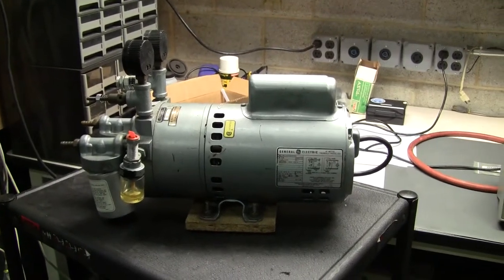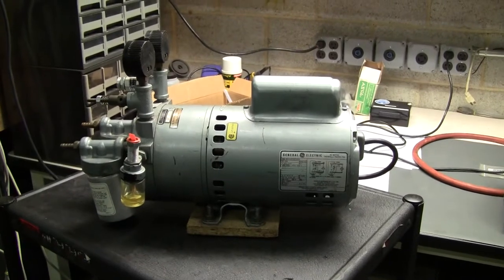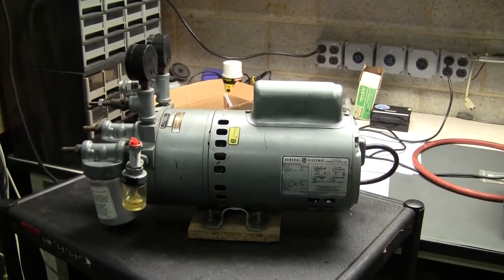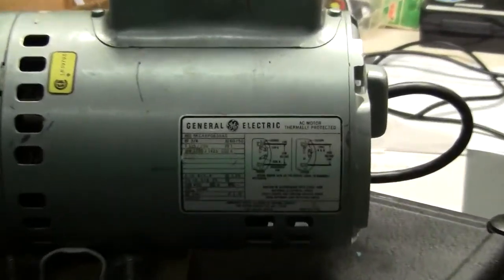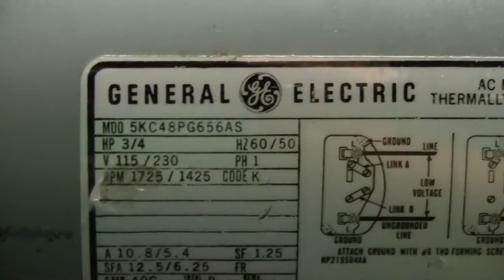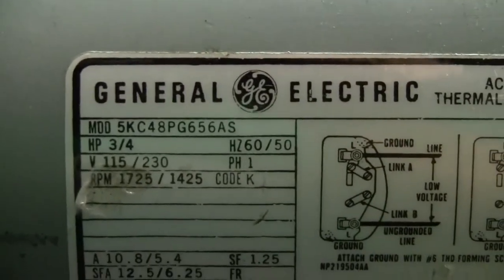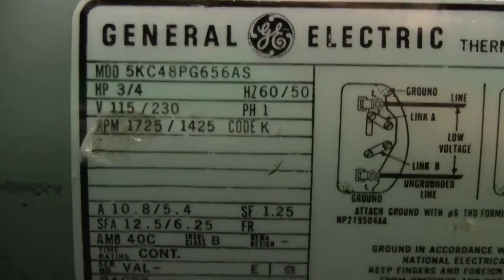Hi, this is Cody Young from Hitech Trader. Today we're looking at a dual-purpose vacuum pump and also air compressor. It's run off of a General Electric motor. Here are the motor specifications: 3.25 horsepower, 60 hertz. It can be hooked up to either 115 or 220 volts.